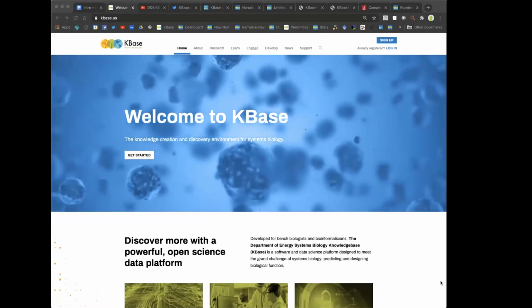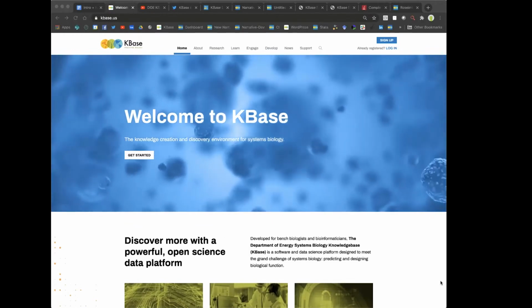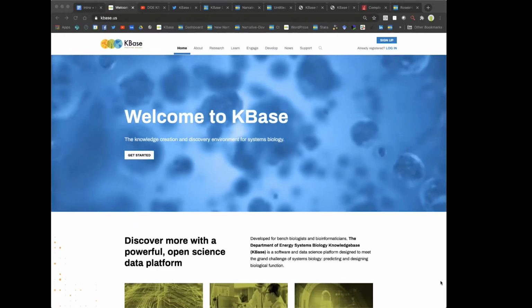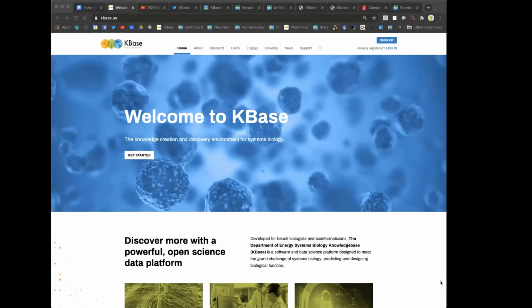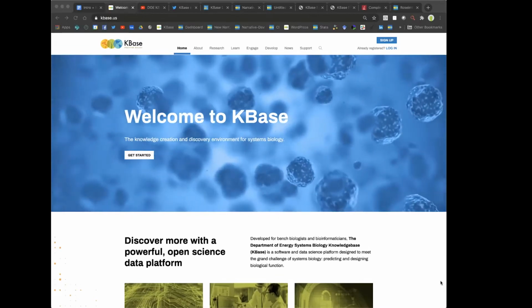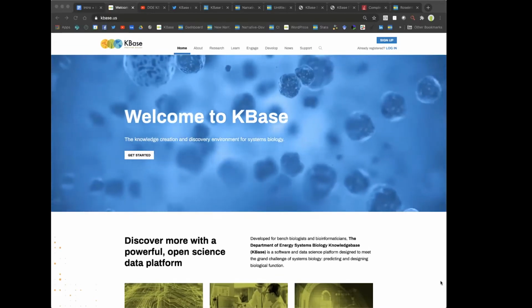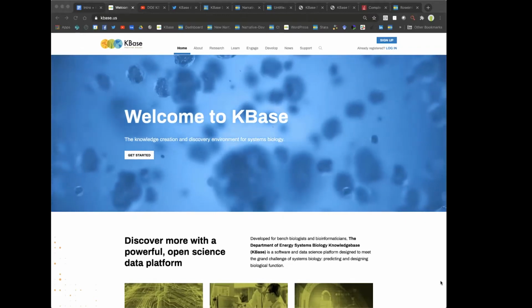So maybe some of you are brand new KBase users. Maybe some of you have used KBase in the past and are coming back to see what's changed or what's new. And maybe some of you are current users who are just learning more about the system. So hopefully we'll have something for everybody in here today.